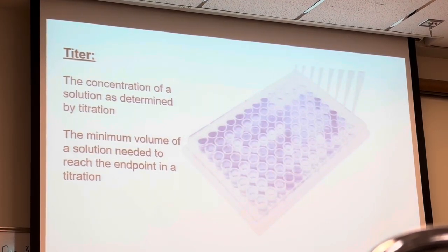So what they did is take her sample as well as 50 other patients, and put her sample in here, and they looked at what concentration, or quantity, it turned positive. Does she have a few antibodies, or a ton? If she has a few, they recommend she gets the vaccine and builds her antibody storage. If it wasn't positive until a certain concentration, then she needed the vaccine. If she was positive right away and had a lot of antibodies, then she didn't need the vaccine. So it's the minimum volume or concentration of antibodies needed to turn it a different color. That's what titer means.